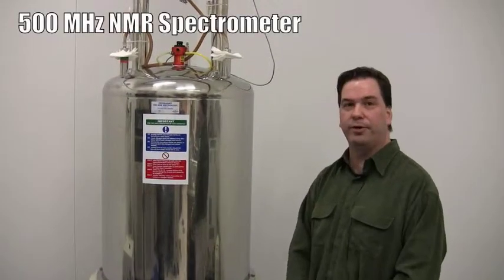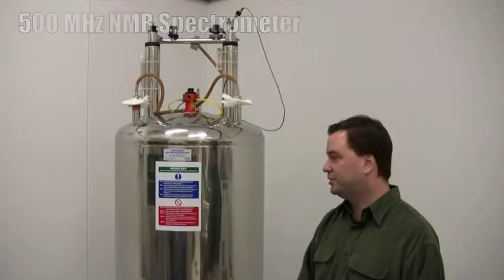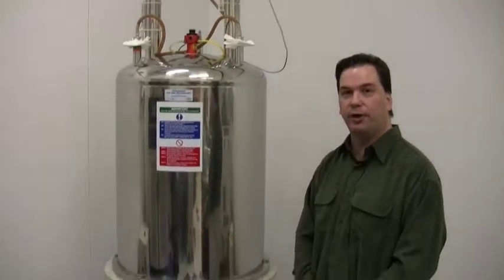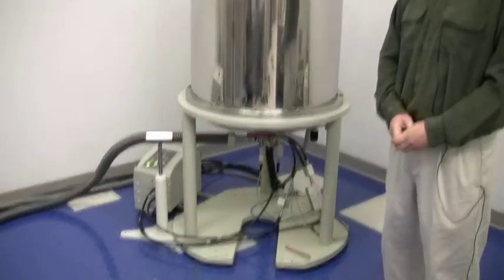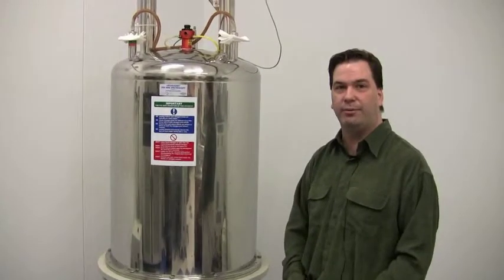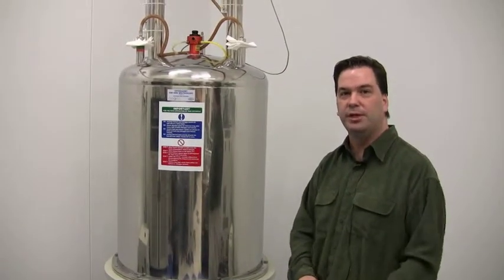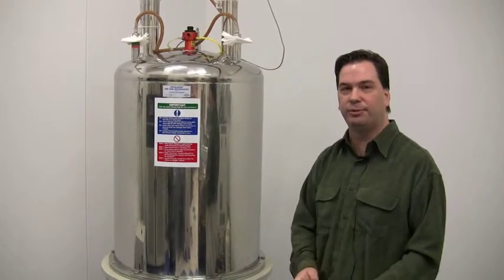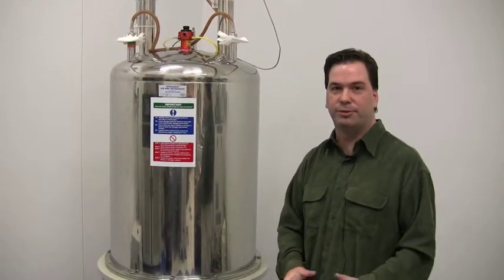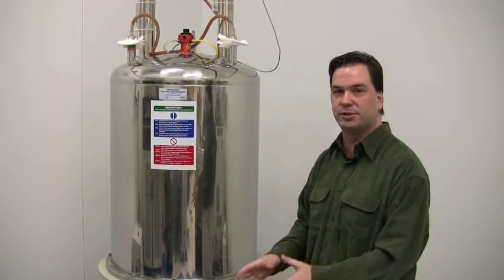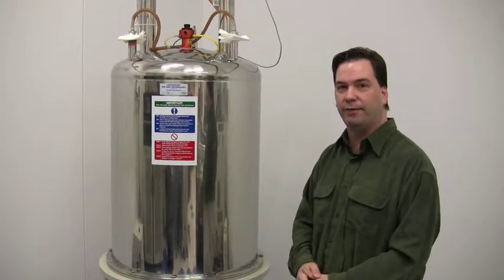This is a 500 megahertz NMR spectrometer. It's currently optimized for proton sensitivity, so students who need more time than our walk-up time, they need more than 15 or 20 minutes, if they would like to do a variable temperature experiment, or if they would like to do some type of two-dimensional NMR experiment, this is typically the spectrometer that they run on.